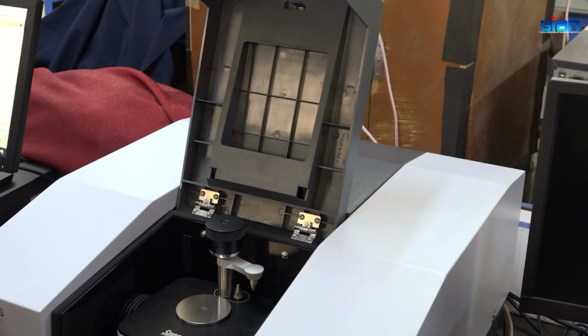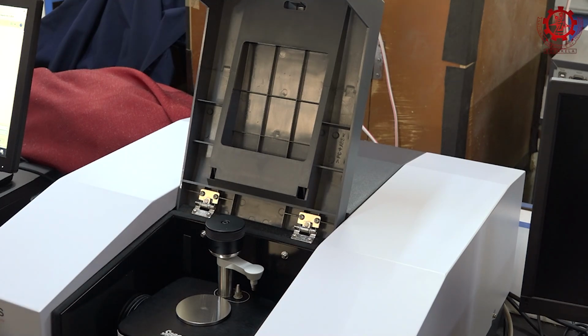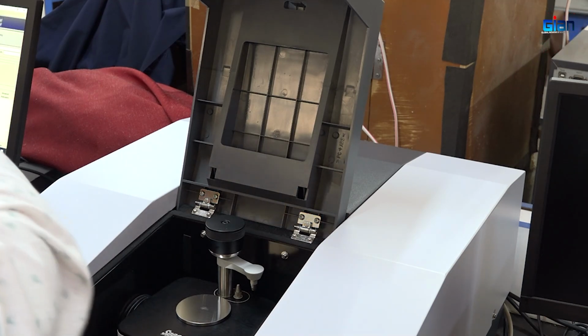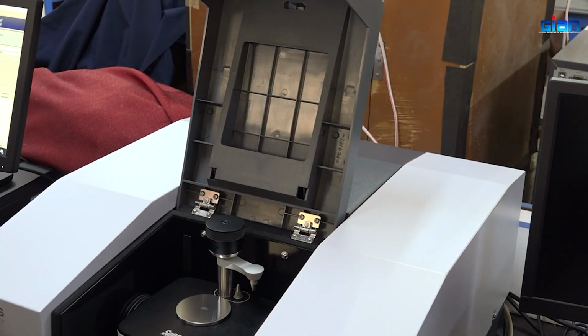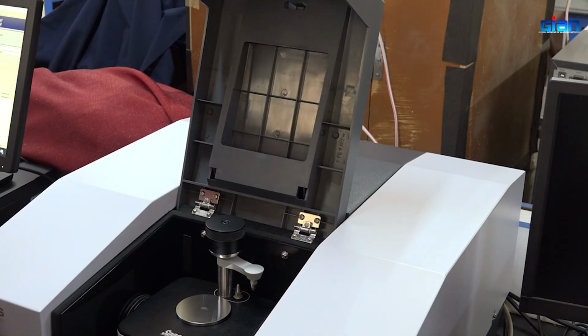So, when this vibration occurs, it absorbs the IR radiation. Okay. So, if it is very big, then it will absorb below 400, that we cannot study. Otherwise, each and every molecule we can study in an IR spectrometer. Okay.